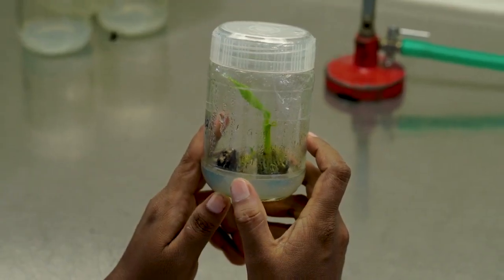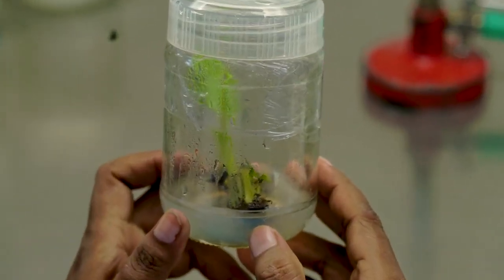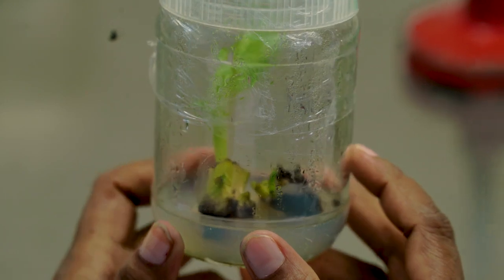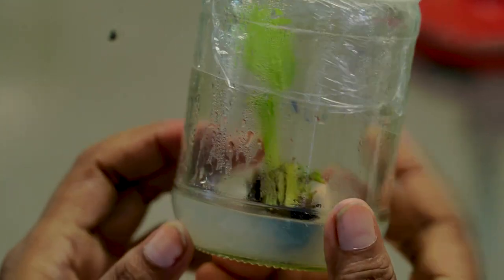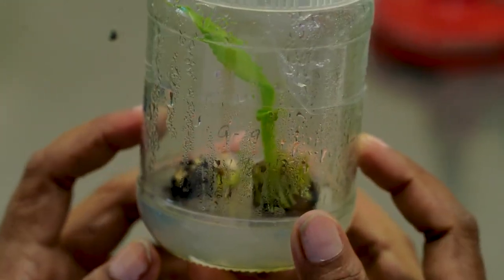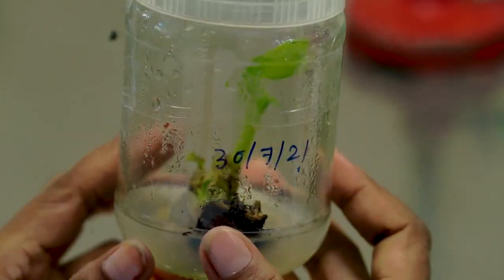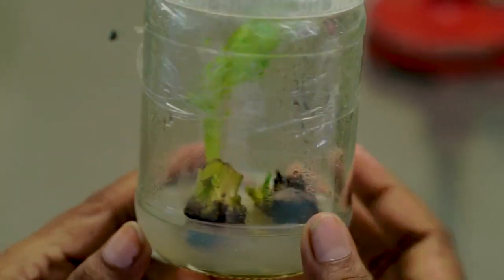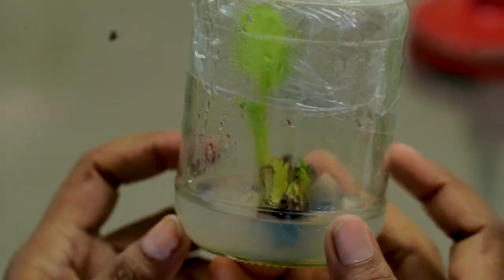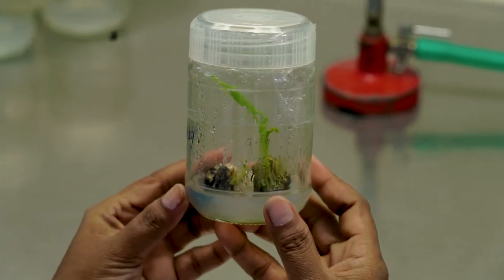Once we have inoculated the shoot tip culture in the culture jar, after 15 to 20 days these are transferred into another medium called multiplication media. In the multiplication media, you will see the growth of the shoot apical meristem; it swells in size, and the shoot turns greenish in color. So this again has to be transferred into fresh media, which will be known as subculture 2.